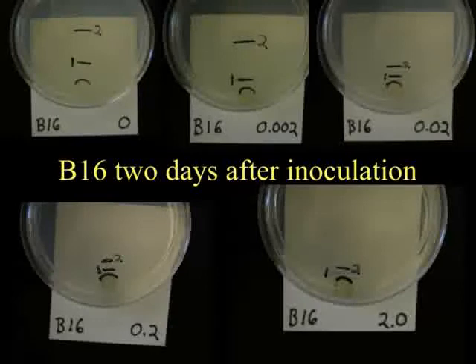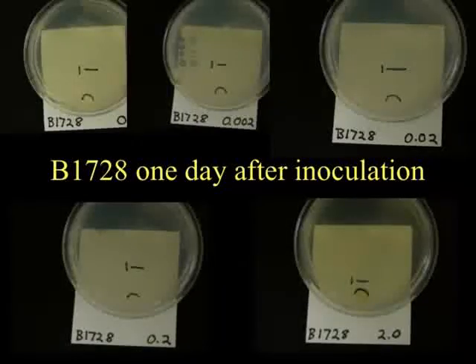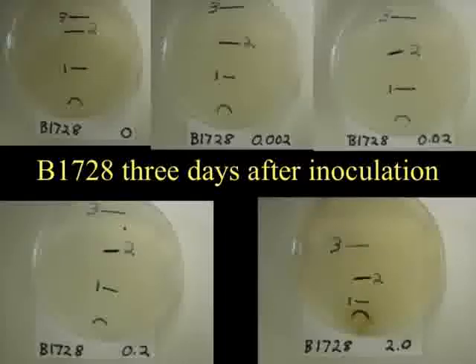After 2 days of incubation, we marked the plates again where the fungus had grown out from the inoculum block, and you need to measure all the growth on all those plates and record the data in the spreadsheet. Finally, after 3 days of incubation, we mark the plates, and you need to measure the growth from the edge of the inoculum block to the edge of the growth after 3 days on each plate, and record that information in the spreadsheet. Now, you do that for both isolates, B16 and then isolate B1728.